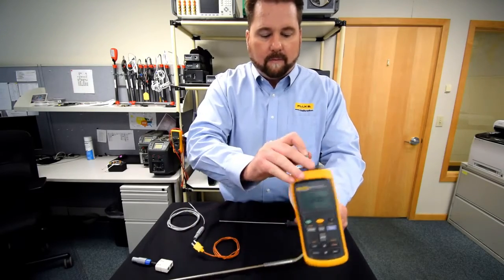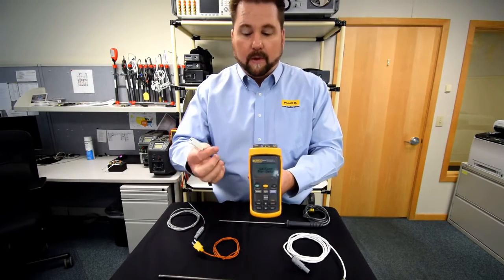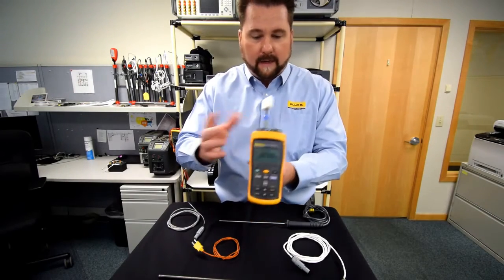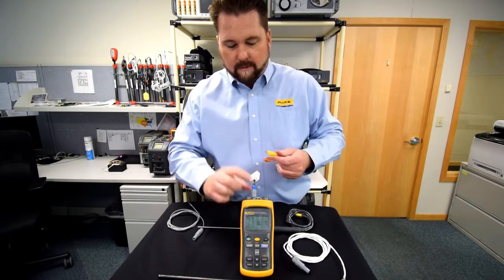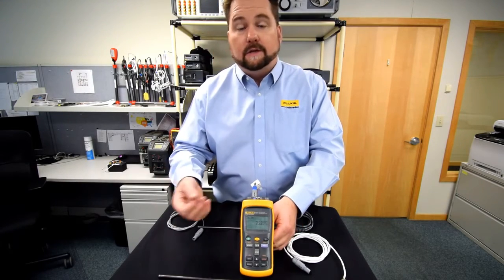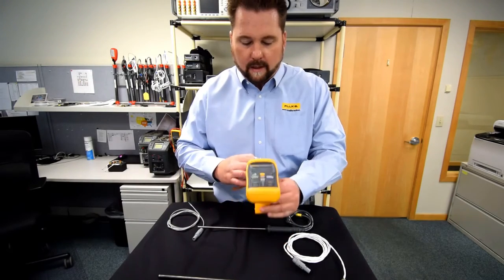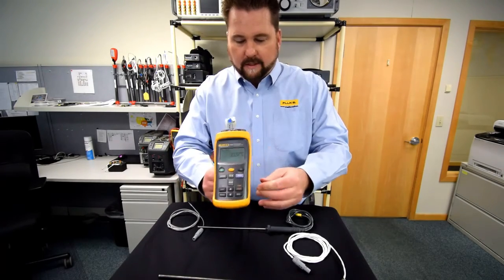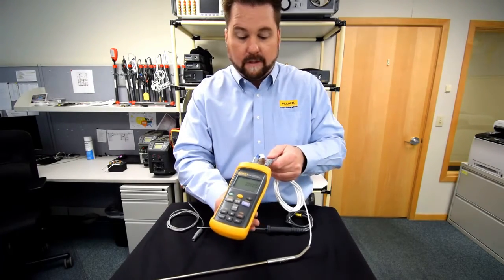For thermocouples, we've got our universal TC adapter, so there's a little more to it than just plug-and-play because it is programmable. Right now this is programmed for type K, so you take any one of our type K probes and simply plug it in — it's pre-programmed for type K. But if you needed to change it to a J or T or something else, you would use our software to tell it what you're connecting. If there's an application where you're reading a device under test that's a thermocouple, your reference standard could be a PRT.